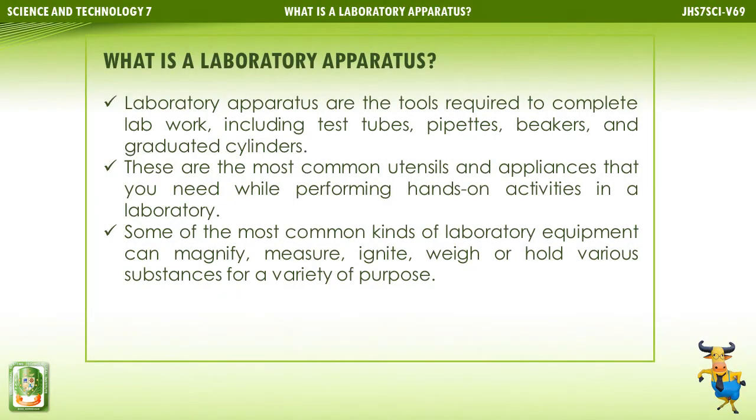What is a laboratory apparatus? Laboratory apparatus are the tools required to complete lab work, including test tubes, pipettes, beakers, and graduated cylinders. These are the most common utensils and appliances that you need while performing hands-on activities in a laboratory.